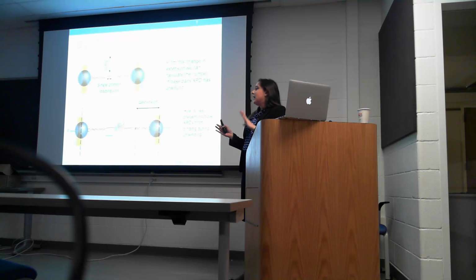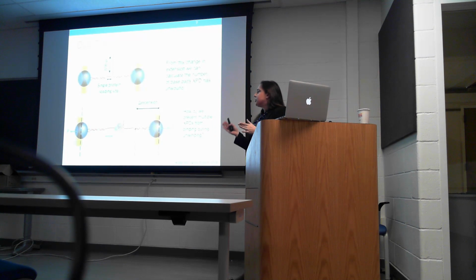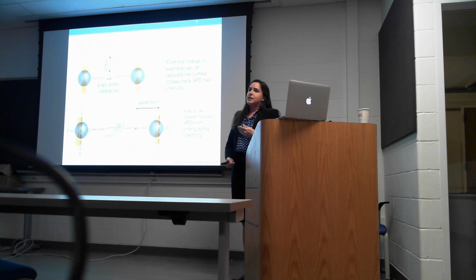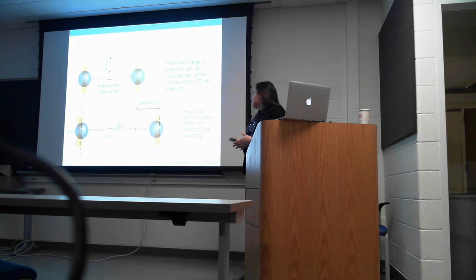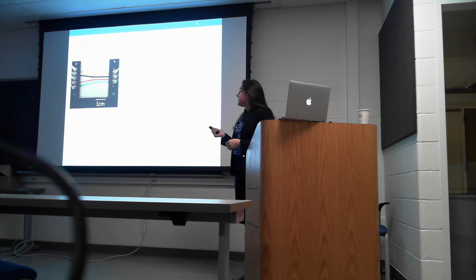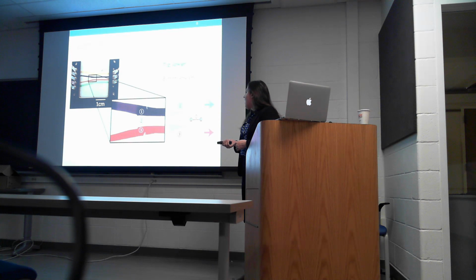So I've hinted that we incubate in XPD and it's exposed to ATP, but how do we control this exposure to ATP, the exposure to XPD, loading these proteins? We accomplish that with a laminar flow cell. This is a picture of the actual flow cell. And if we zoom into the experimental area, there are 3 streams that meet.